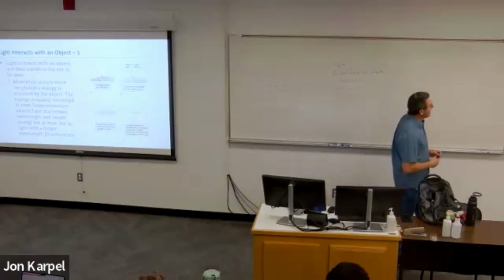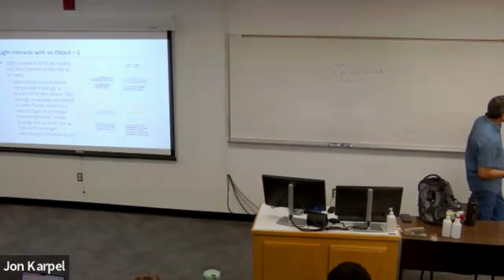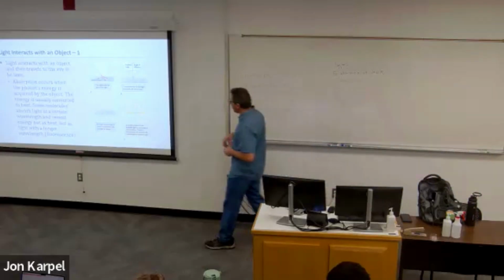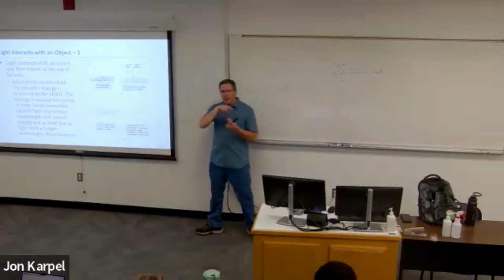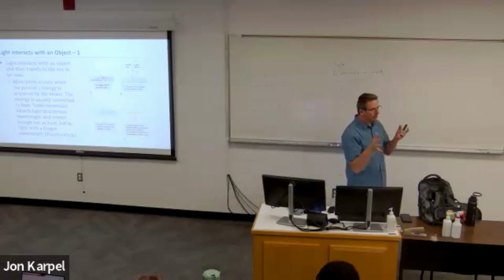A couple things. So of course, light can be absorbed. We're not really worried about that. Really what we're looking at is light that either refracts or reflects or goes through a sample, is transmitted through a sample. Some of this we'll have to deal with when we use the 100x, because of the way that light interacts between glass and air, called the refractive index.